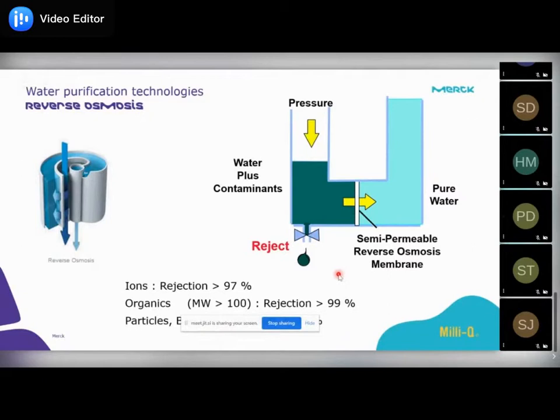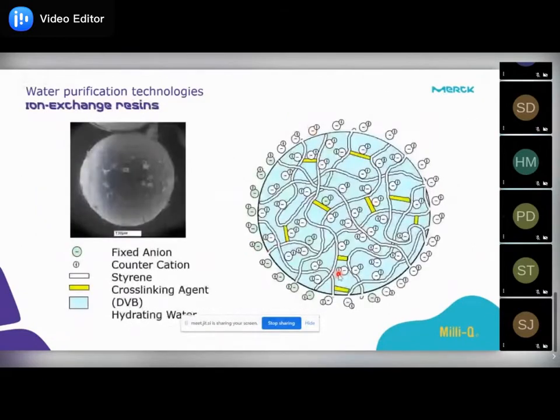Similarly, there are a lot of specialized ion exchange resins which allow us to remove various kinds of ions, starting from anions and cations. We also use various kinds of mixed bed ion exchange resins while doing various kinds of filtration, specifically for the removal of ions.